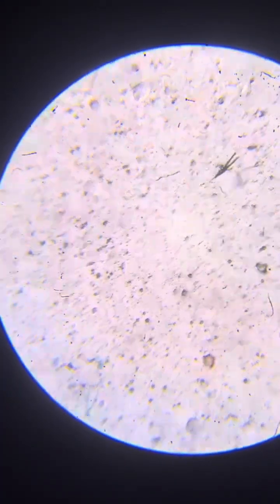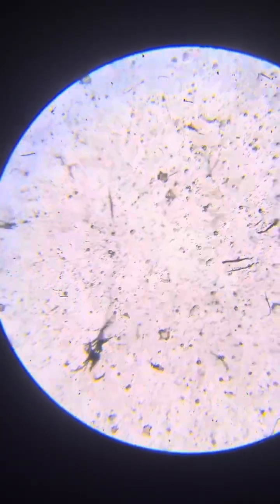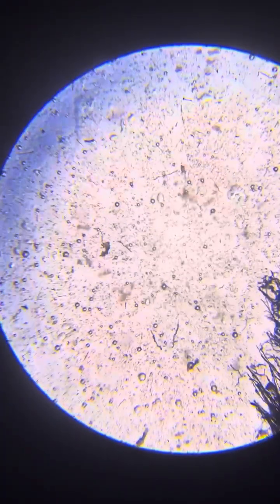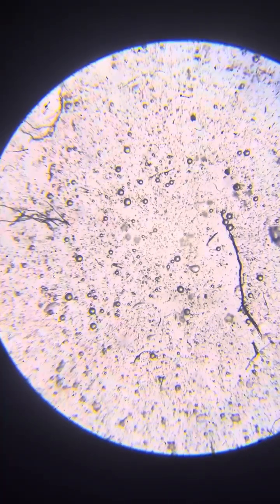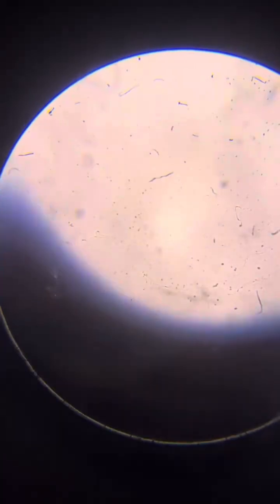So again, we see mostly smaller ones, not bigger ones, not even medium ones, but we see quite a bit of smaller ones. So it's not that bad. We have focus issues, so it's difficult to find the correct focus. But it's not a bad sample. It's just a little less rich than the previous one, but not significantly less.